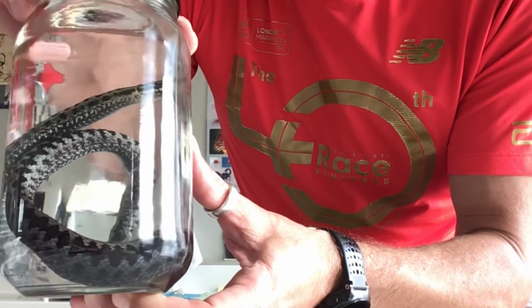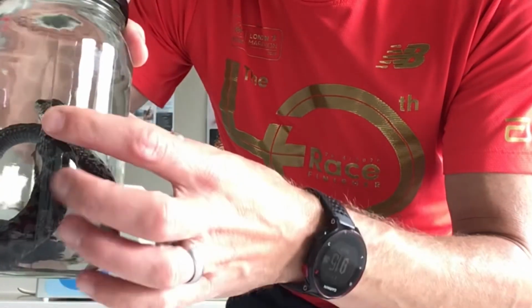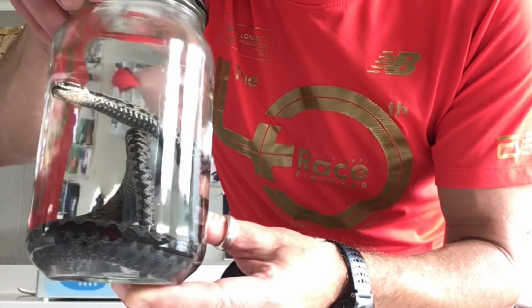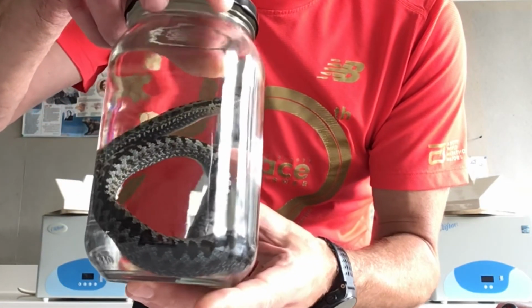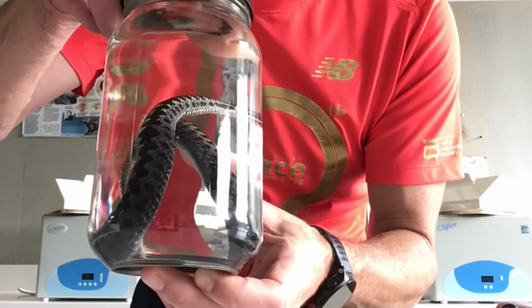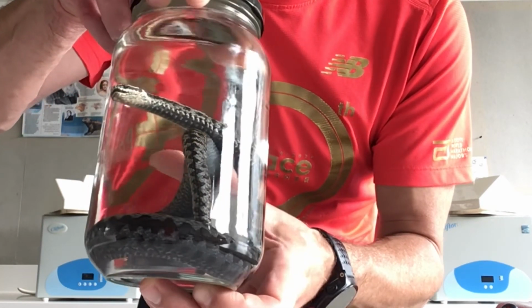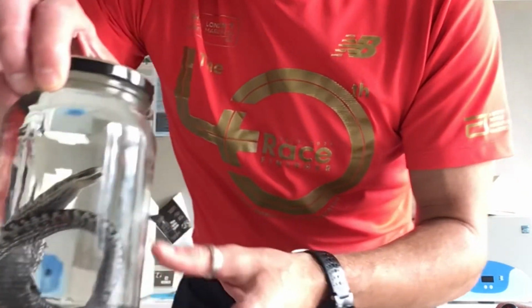One thing that I was concerned about was the site of the injury, which you can see. So where he got squashed, I don't know if you can see just there, there was a bit of tissue leakage, so there was some stuff coming out of there. After I had him in the formalin, I got him out, rinsed with distilled water, and I noticed there was some stuff coming out, so I actually tried to seal that hole with super glue. I did just cover the area with super glue to stop any bits leaking out, because I didn't want that tainting the liquid inside, to keep it nice and clear.